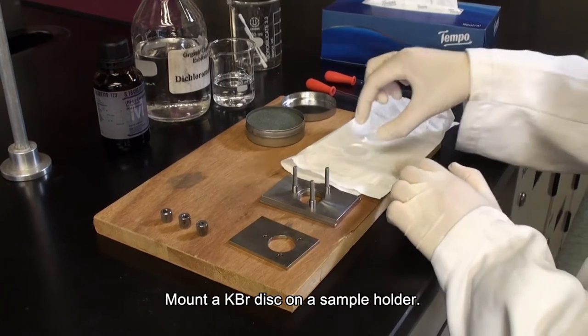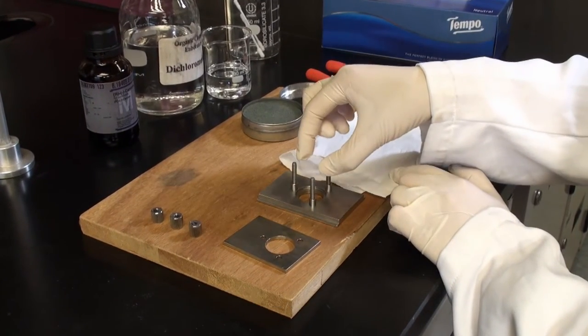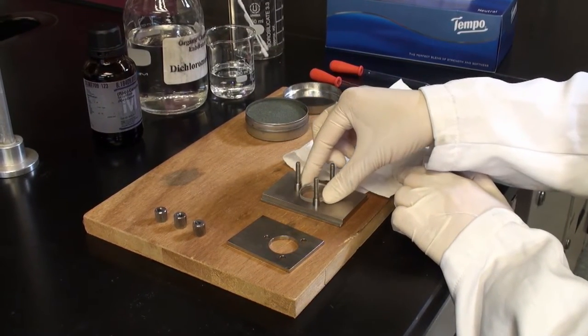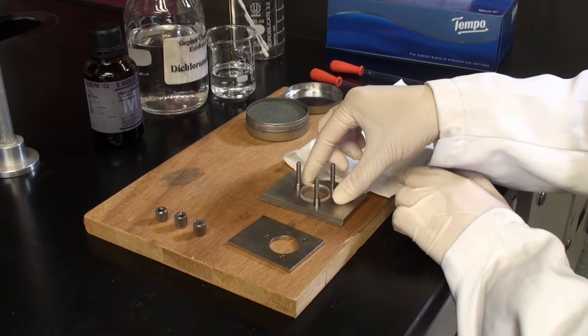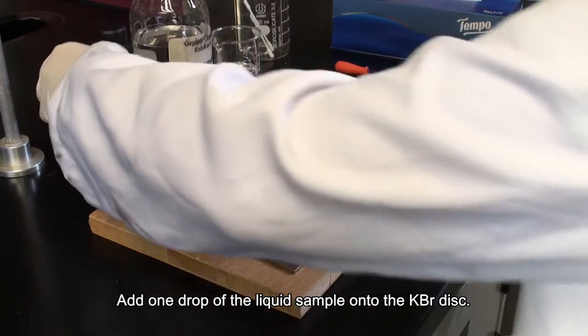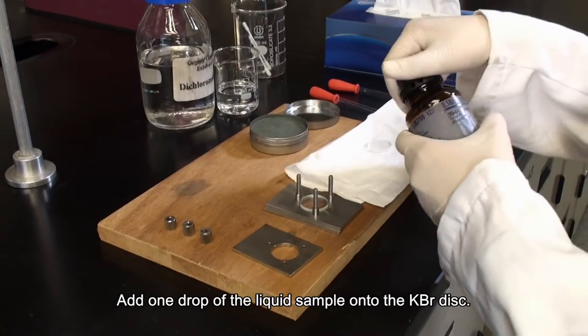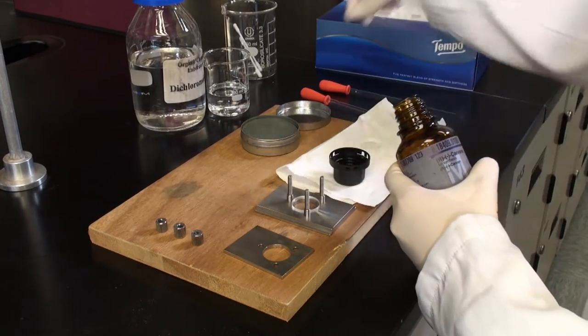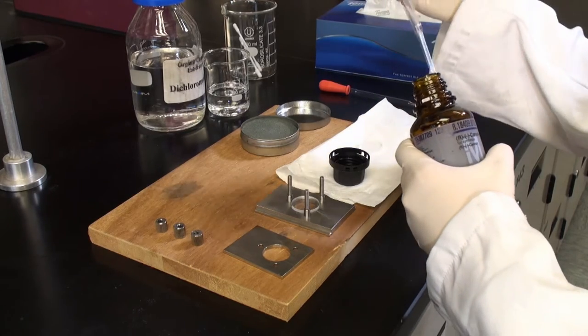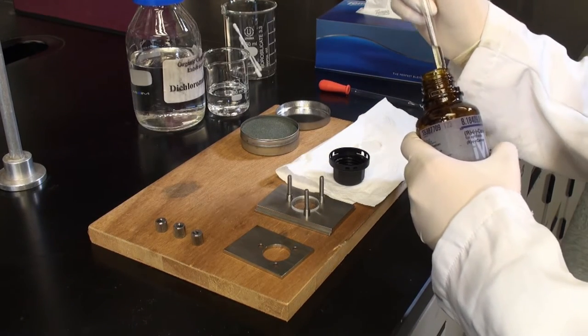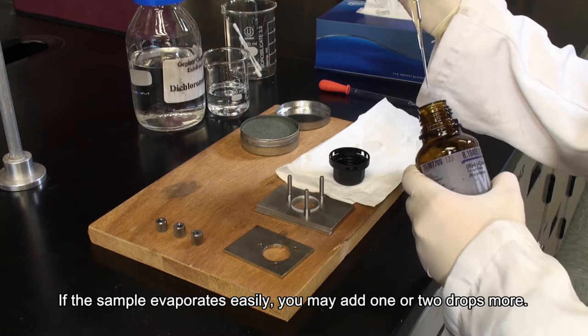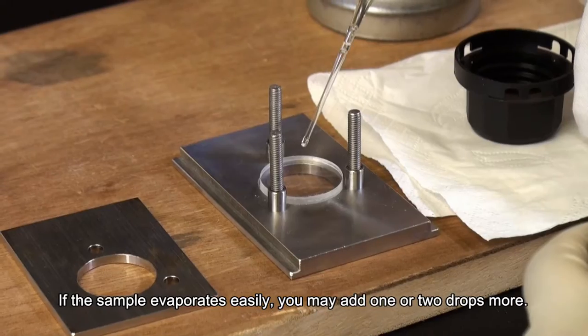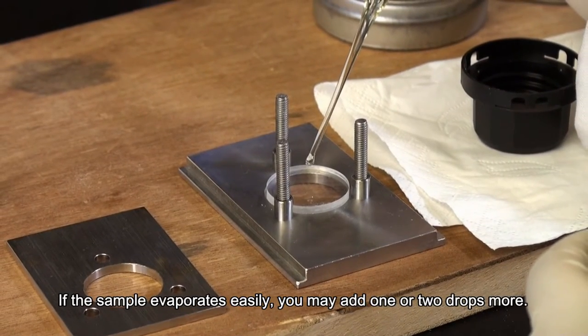Mount a KBr disk on a sample holder. Add one drop of the liquid sample onto the KBr disk. If the sample evaporates easily, you may add one or two drops more.